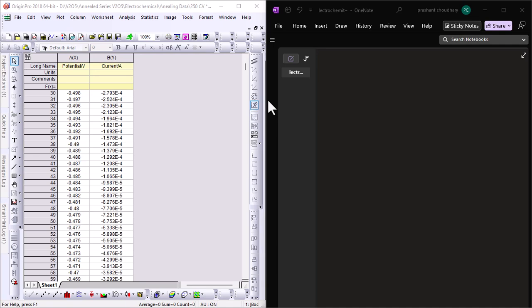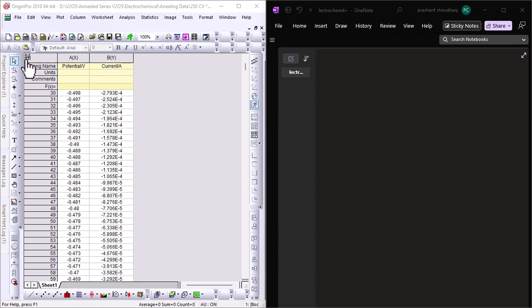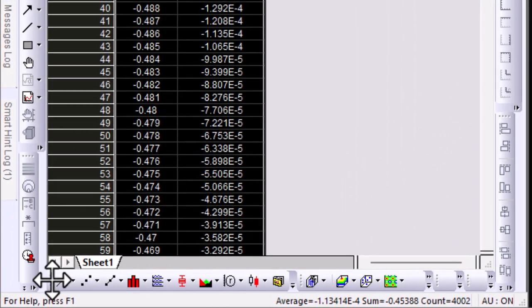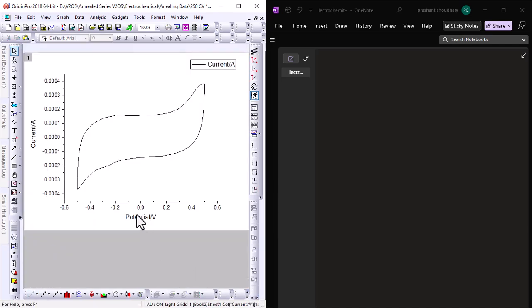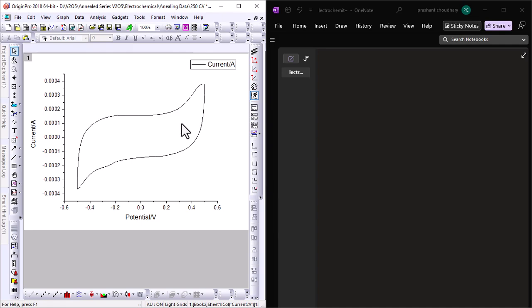Now let's talk about the CV curve. Here I have data that I'm going to plot. This is a plot of potential versus current - a loop that reflects the current response during forward and reverse voltage sweeps. The area under this curve is directly related to the charge storage capability of the material.